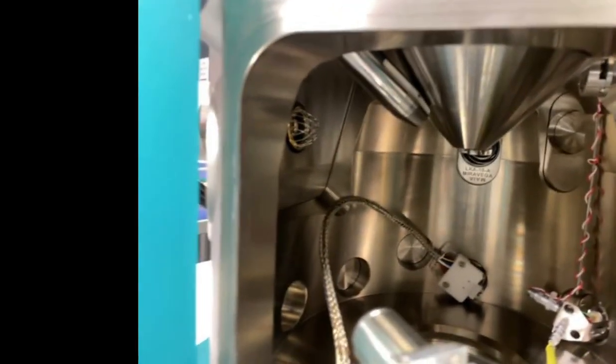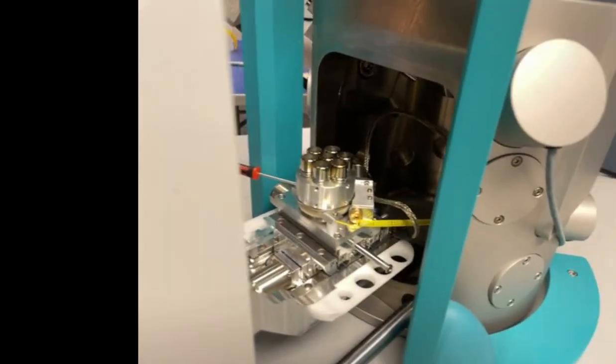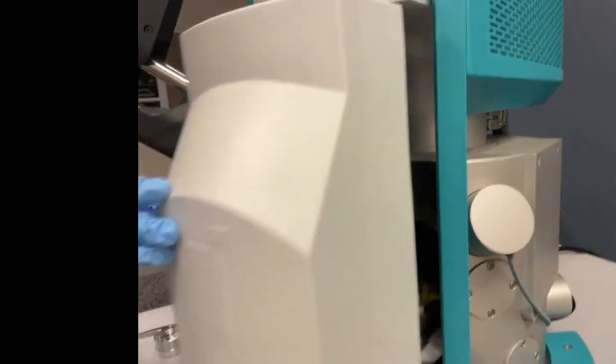So that thing up there at the top that has like a wire mesh around it is the secondary detector. The one that's right above us to the left, like 11 o'clock, is the EDAX detector. And then the cone up there is the pole piece. And that's the camera looking in on far around the corner. You can't quite see. And then she's just putting it in, lining it up with the pins, and then we close it carefully.